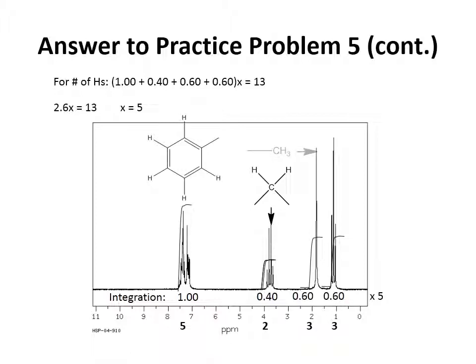Then the 3s are, of course, 2 CH3 groups, which are in different chemical environments. Note that if you add up all the carbons, we're only left with one other carbon. So therefore, our initial idea that the infrared spectrum was showing a C double bond O in an amide is correct. It can't be C double bond C because that would be too many carbons.